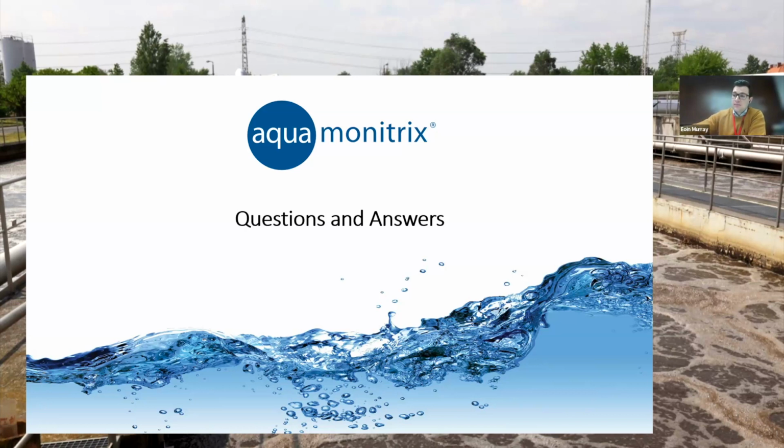Yeah, that's a great point. You might have noticed I said approximately 4 minutes. The default setting on the configuration is 4 minutes, but you're absolutely right, it's dependent upon the application. We can change that depending on the settleability. We have some customers that operate at 6 minutes, others at 4, etc. But it's dependent on the settleability. And what's nice about it is that you can assess the settleability visually in terms of timings on install, so it's quite straightforward to do.